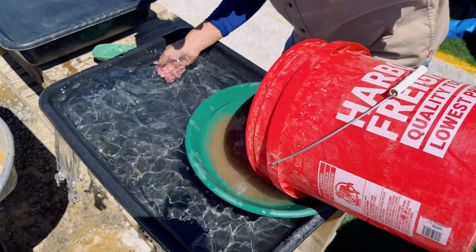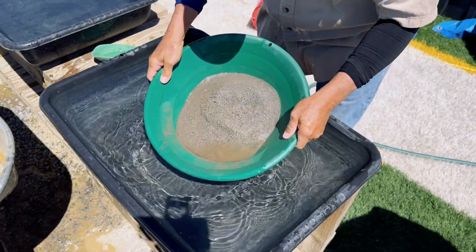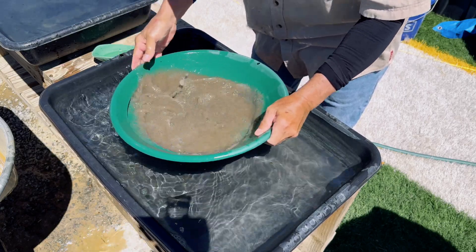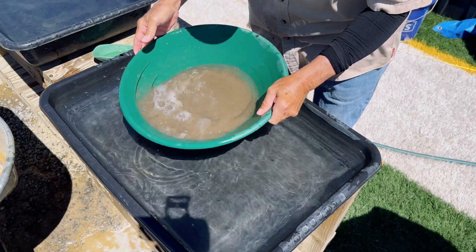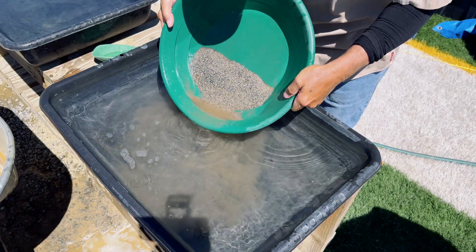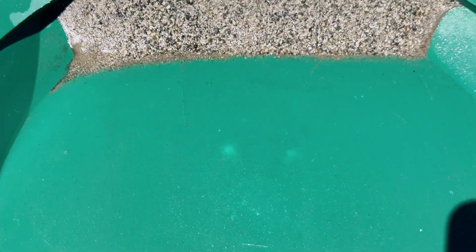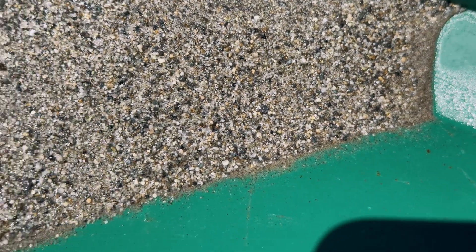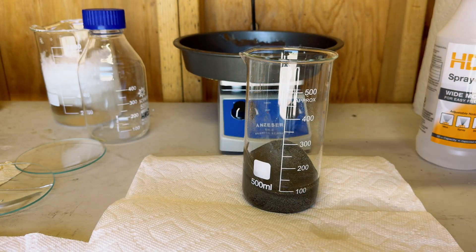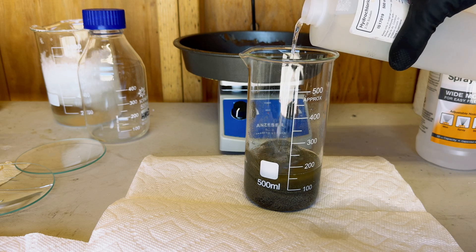Now it's time to pan out our concentrate. This camera shot does not justify the view, but there are some tiny sulfides at the bottom and on the edge of this material. We now have our material in our 500 milliliter beaker, and now we are going to do our hydrochloric acid wash.